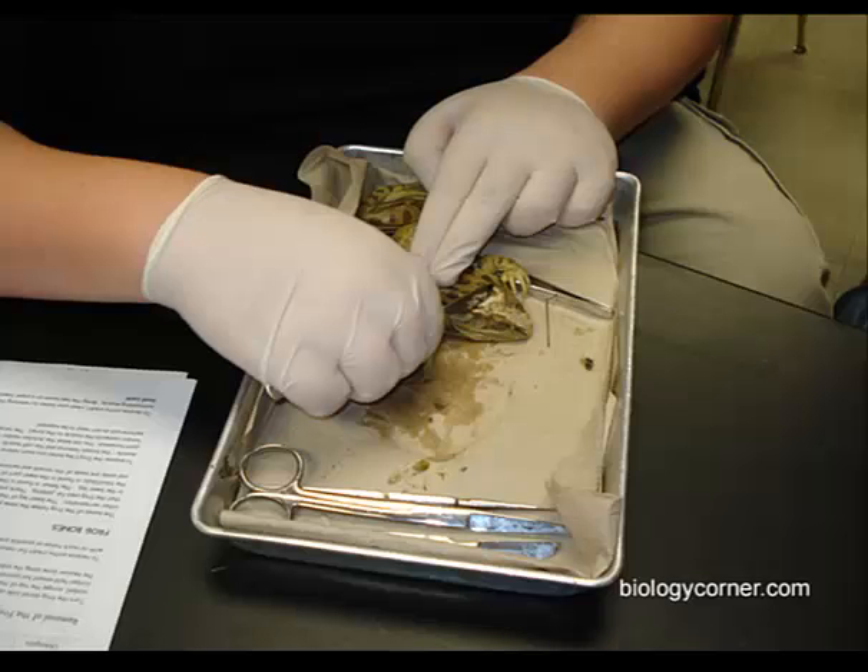If you get to it, you can dissect the nervous system. You'll be responsible at least for identifying it. Dissecting the nervous system is going to take a good amount of care and skill.